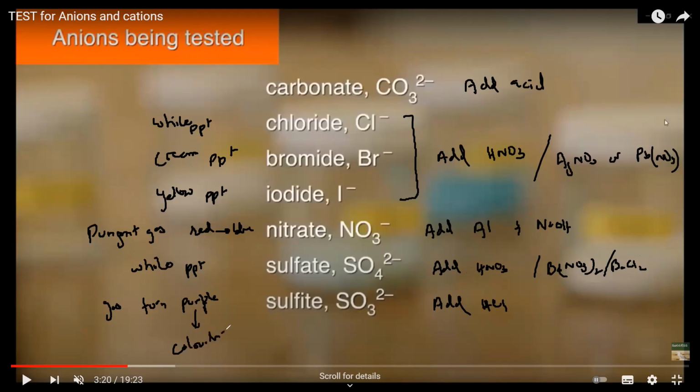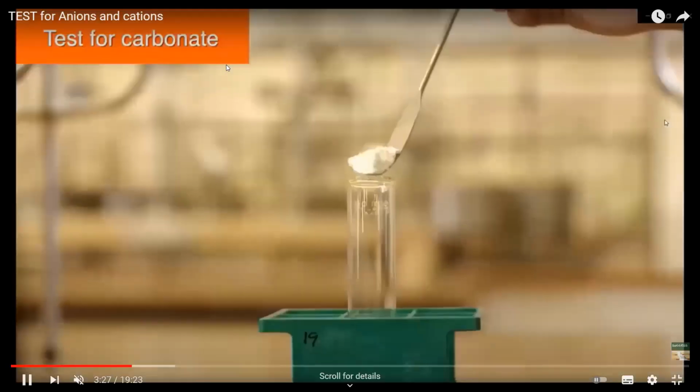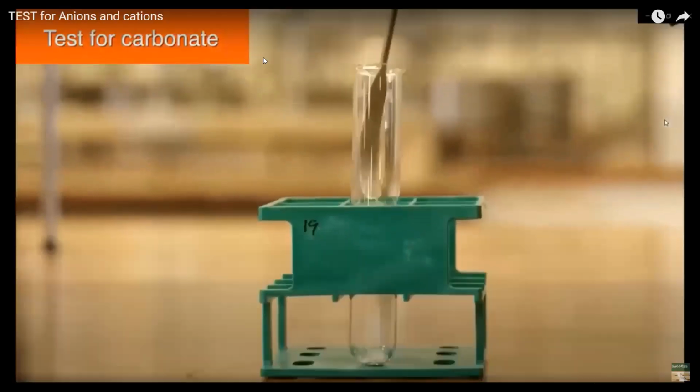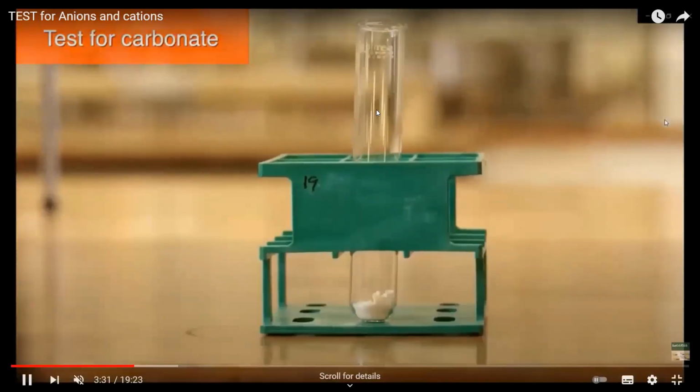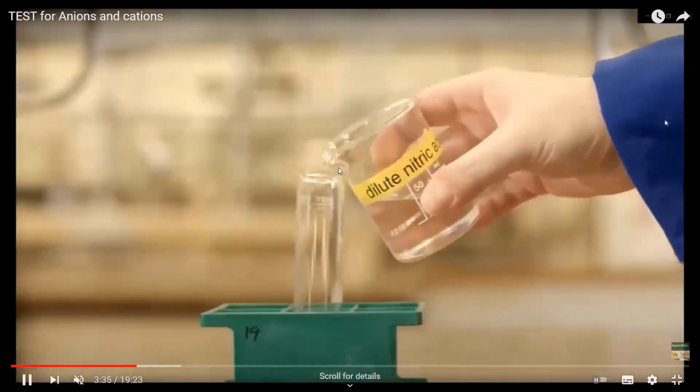So in this video, you will see all the color changes and the observations related to these ions. First example, if we want to test a carbonate ion. Here is a salt which contains carbonate. What we did, we added nitric acid.